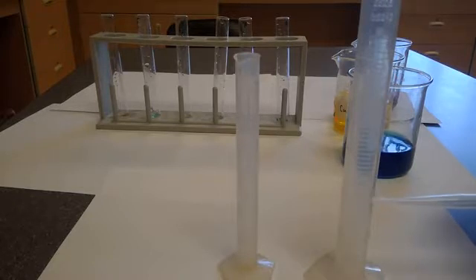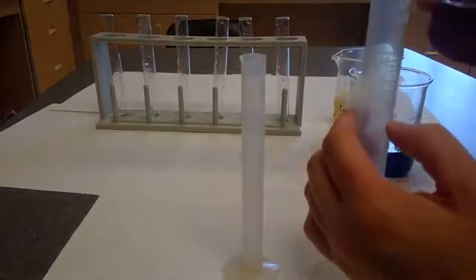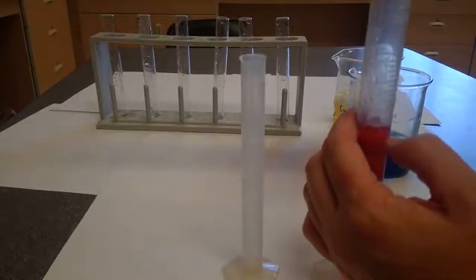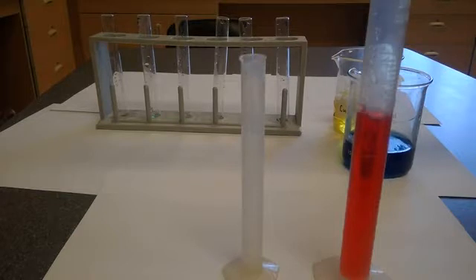For example, here's 10, 10 and a half, 11, 11 and a half, 12. So you can see that when I'm measuring this, I'm going to have to be extremely accurate. So 19 milliliters of water is going to be right about here on my graduated cylinder. So I'm going to put the bulk in as best as I can. And then I do have a pipette for fine-tuning it. I cannot stress the importance of accuracy. I'm also doing my best to record the meniscus line, which is that lower part.